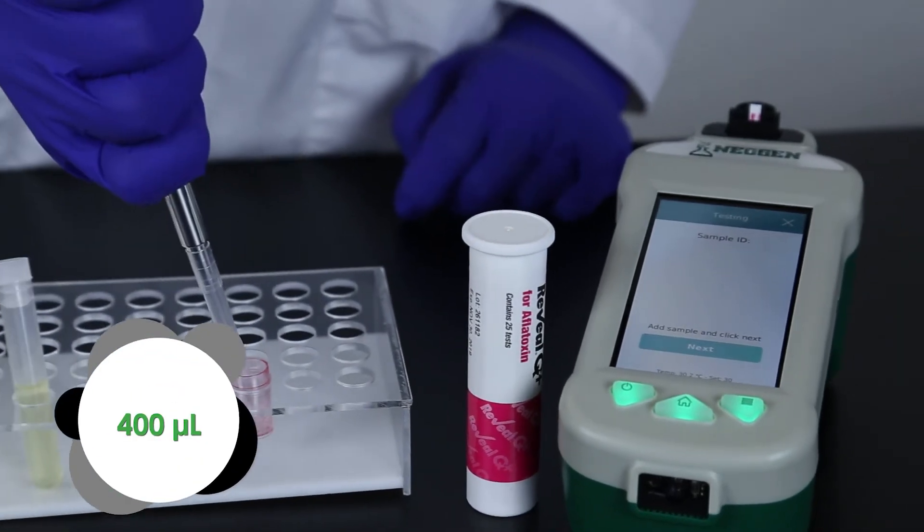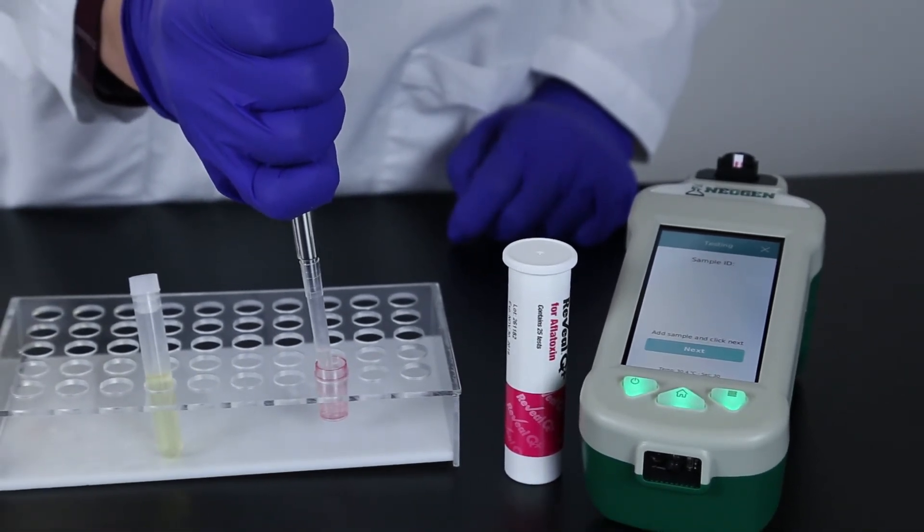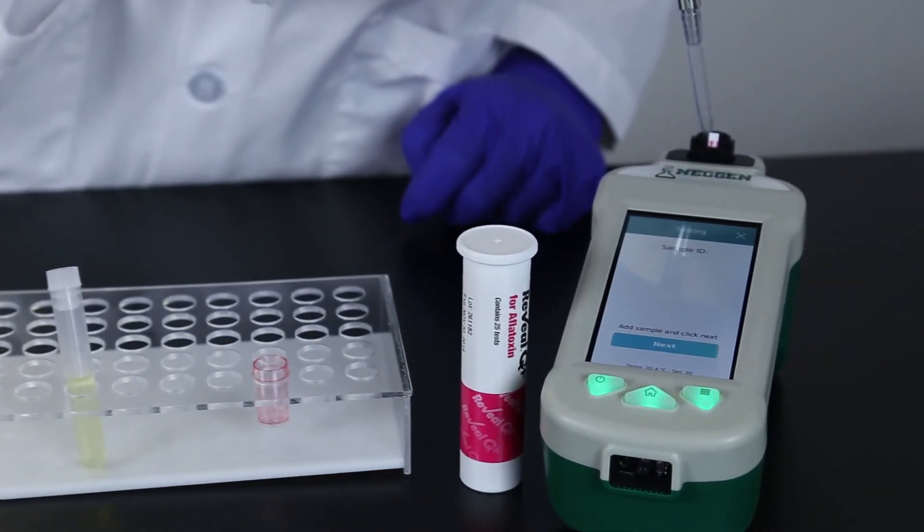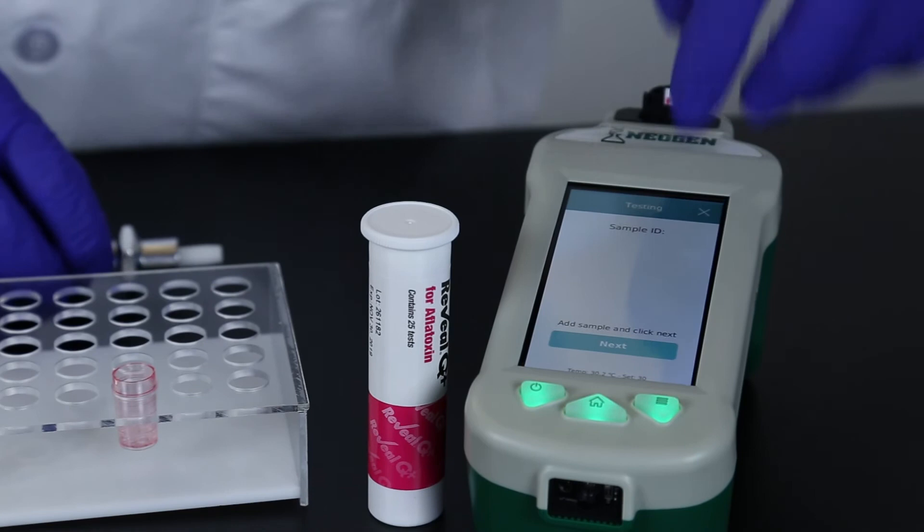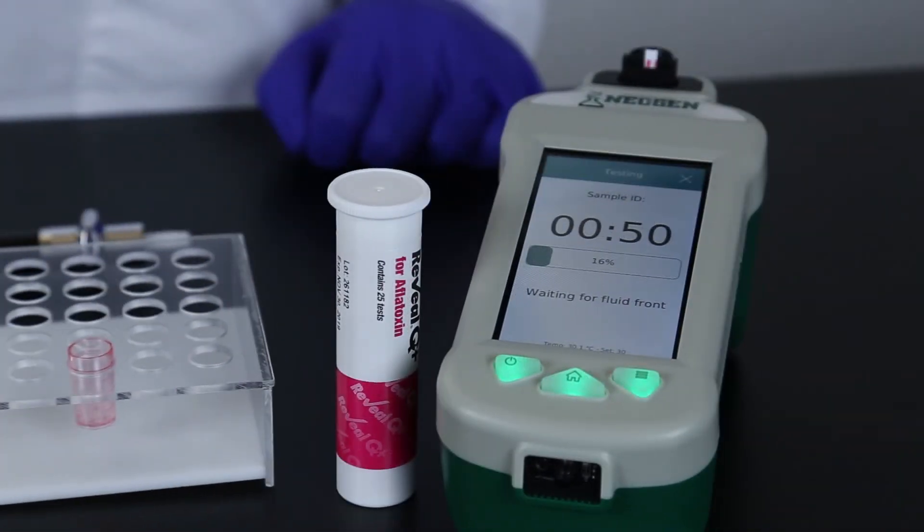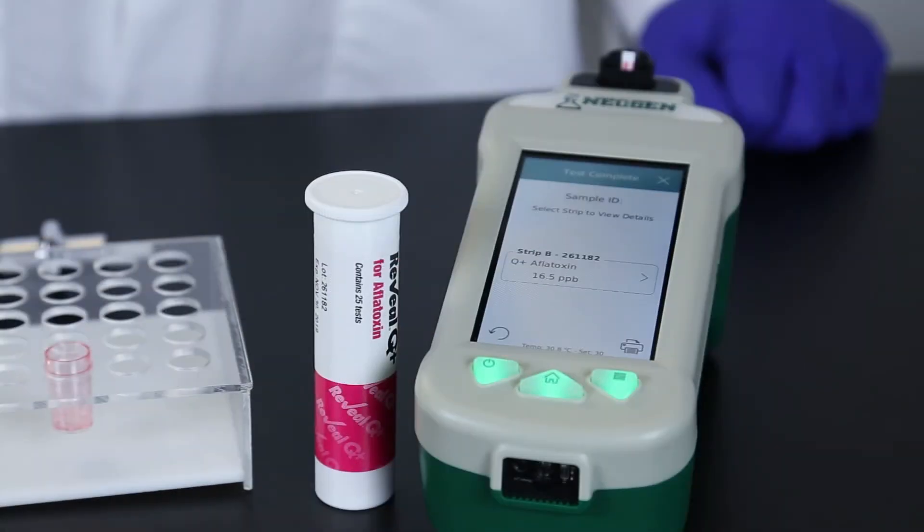Pipette 400 microliters of sample into the Raptor cartridge. The system and timer will start as soon as it detects the fluid front on the sample strip. After the six-minute testing time, the Raptor displays your results.